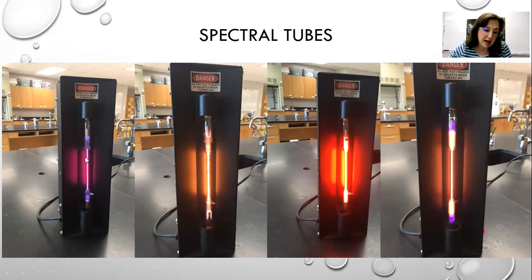This one right here is hydrogen, this one is helium, this one is the bright lights of neon, and then over here on the right is our nitrogen. So those are the 4 that we're going to look at. Again, hydrogen, helium, neon, and nitrogen.